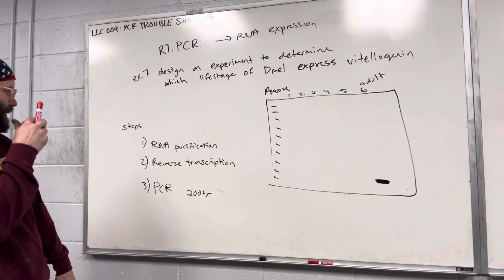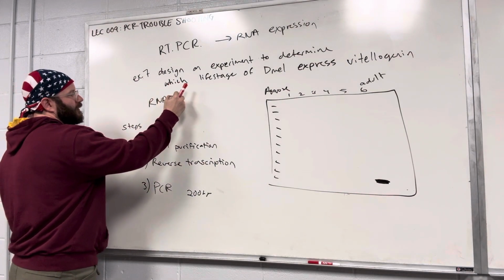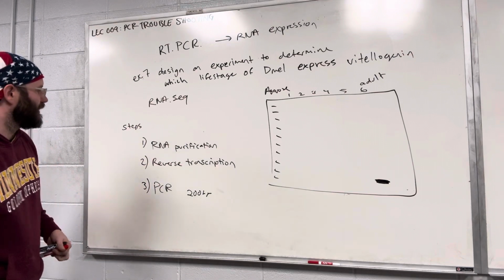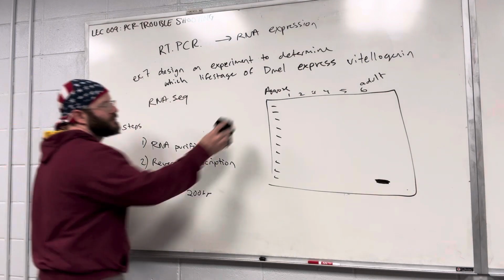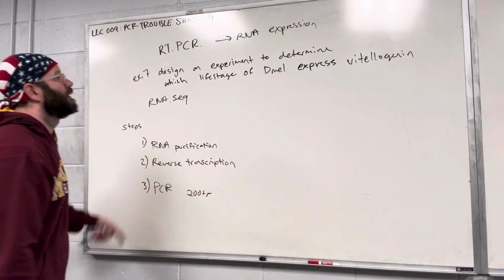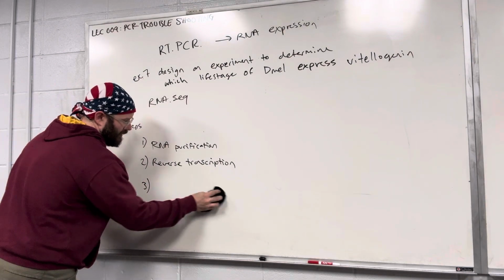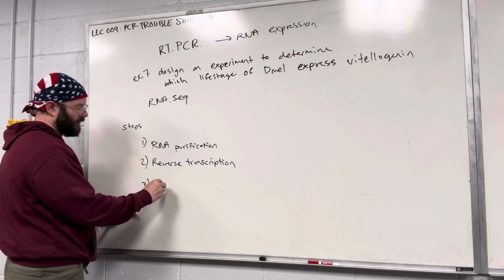Okay. So then let's define RNA-seq. There's different ways to do RNA-seq, but oftentimes it utilizes a reverse transcription step. So in RNA-seq, which is also used to study expression of genes, you would do the RNA purification, you would do the reverse transcription, and then oftentimes different things happen. Sometimes you would make a library.